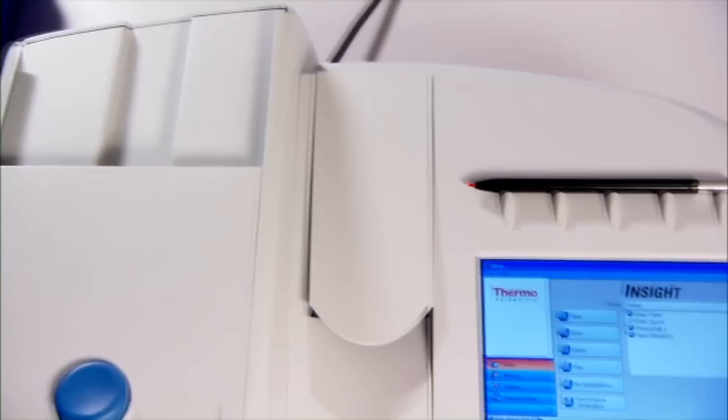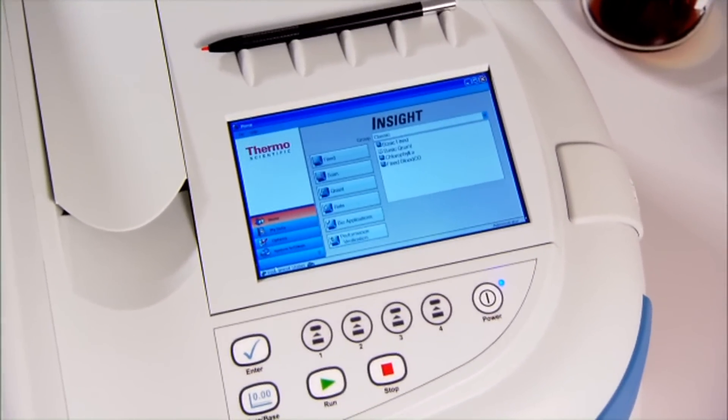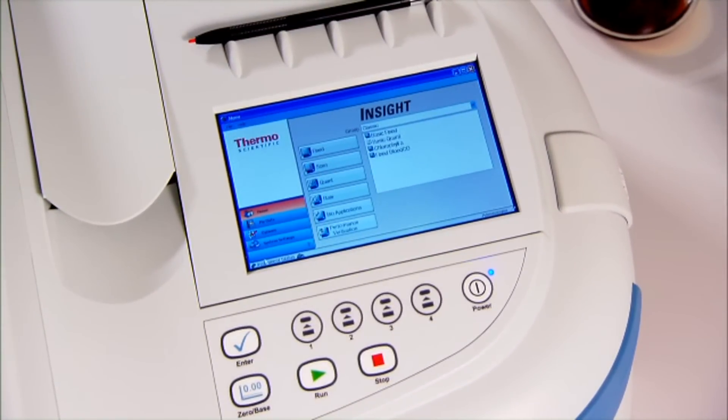Insight software to simplify user interaction, improve accessory control, and streamline data collection using multi-session workbooks.